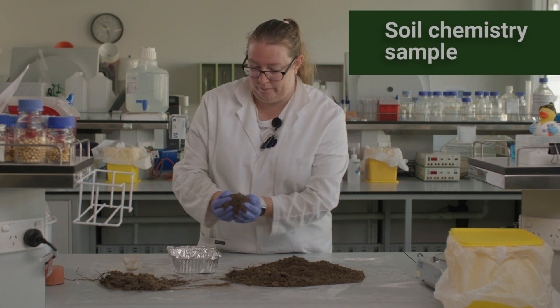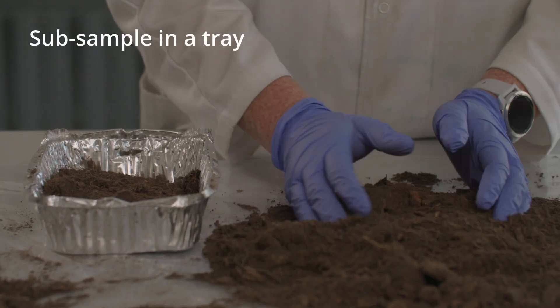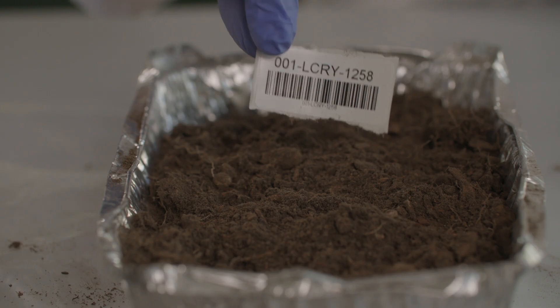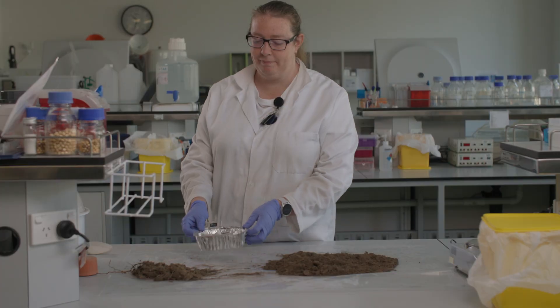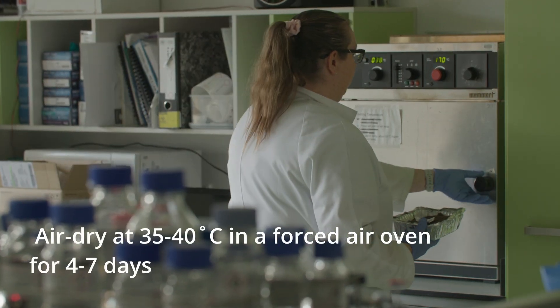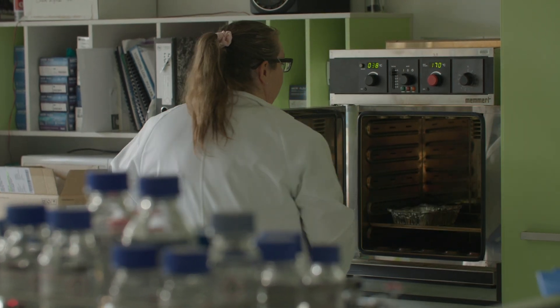Moving on to the soil chemistry sample. Place a representative subsample of around 500 grams into an aluminium tray with a unique sample label. Air dry the sample in a forced air oven set at 35 to 40 degrees Celsius for 4 to 7 days.